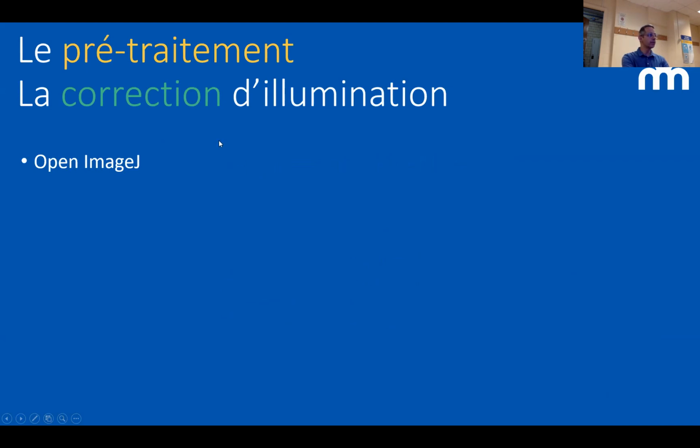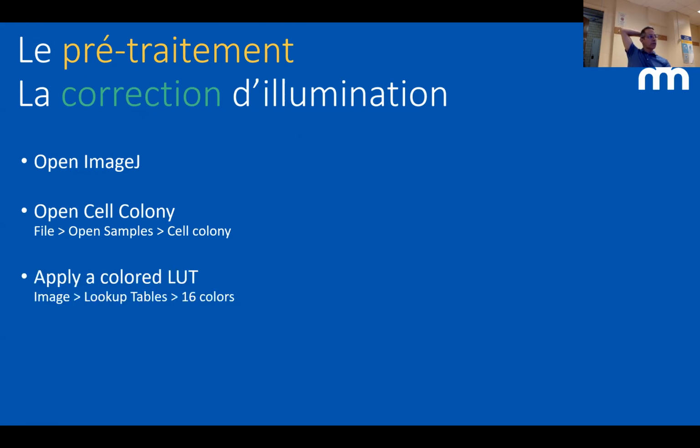The first thing we're going to do is about correcting illumination. A very usual thing we see is when the light coming into your microscope or into your image is not ideal, or it's not perfect, and then you need to correct for this. We're going to do this together by opening ImageJ and opening the sample called Cell Colony. To have a look at the issue, we're going to display the color lookup table called 16 colors. And I'm asking you guys, what is the issue?